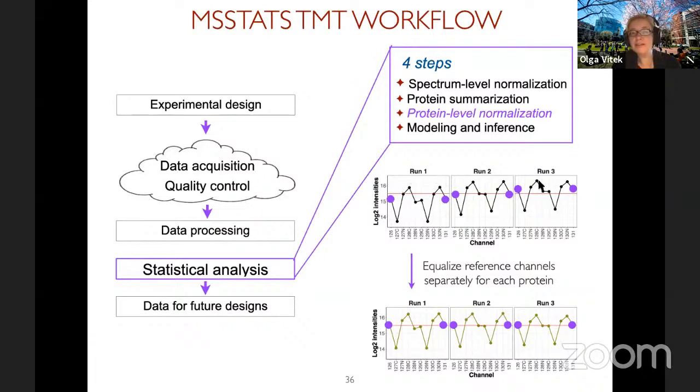There can be really actual differences in biology, which we will eliminate by doing that. So we have worked with different flavors of that, and we found that without the reference channel, we essentially throw away the baby with the bathwater to some extent. So it is more effective to use reference channels and adjust the intensities of endogenous signals with respect to that amount.